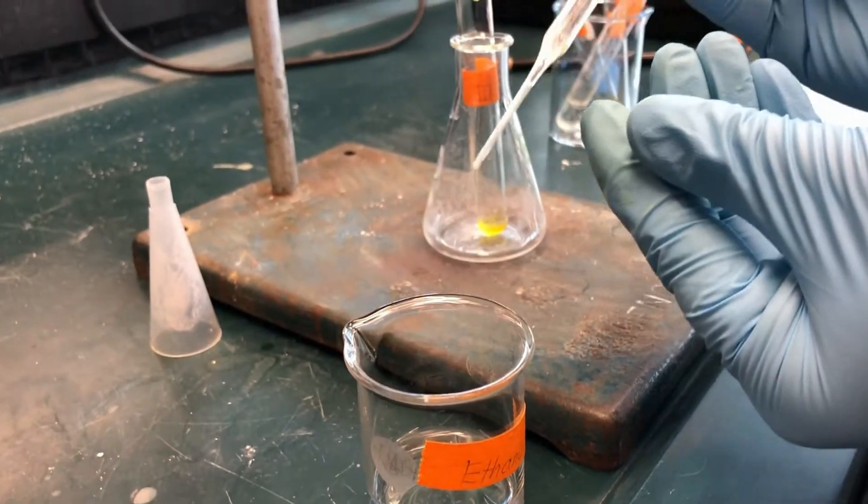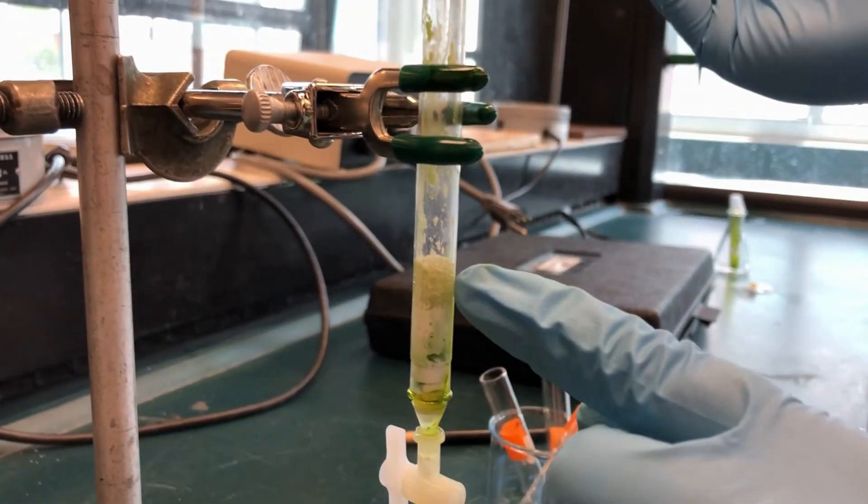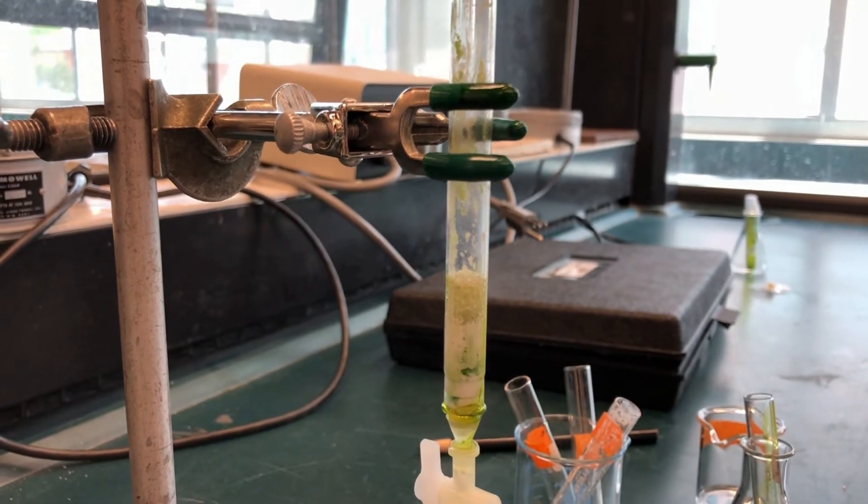If the green band does not begin to move, change to the more polar solvent ethanol. We add ethanol to move the green band down.